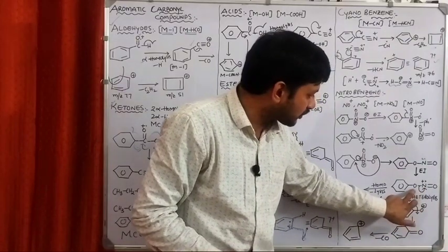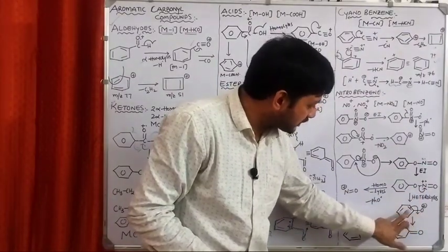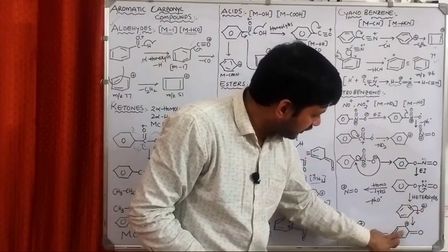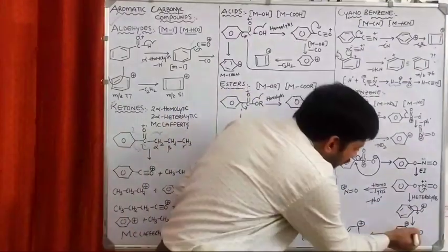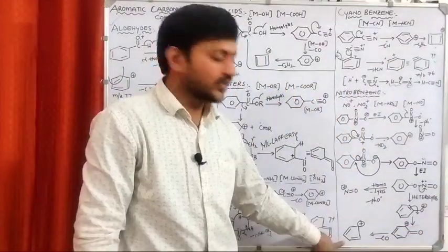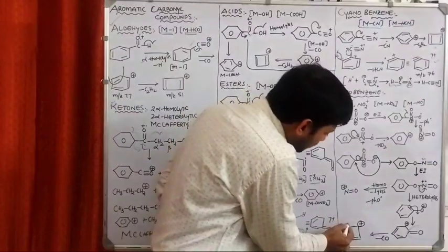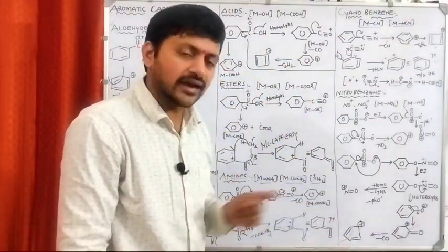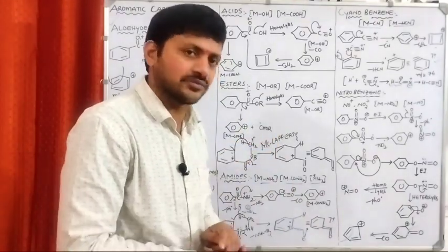It can produce as what? Oxygen plus. This is involved in the conjugation. The plus charge shifted towards this one. Thereby we are getting this type of ion. Now we are removing CO to produce a 5-membered ion. From the 5-membered ion, if you remove this one, you will get the 3-membered ion, 39 m/z. Already we had a discussion in the previous examples.